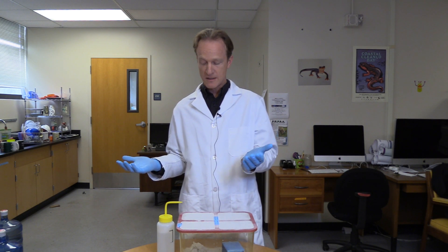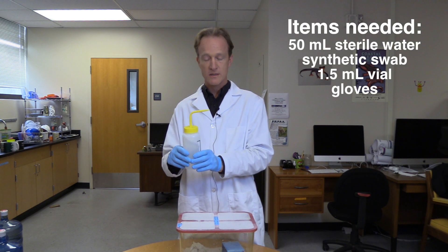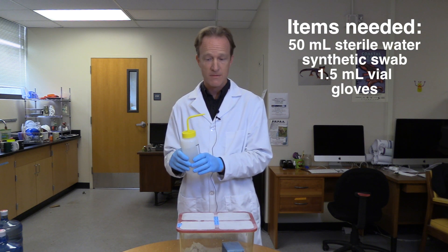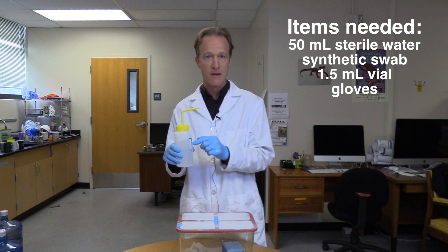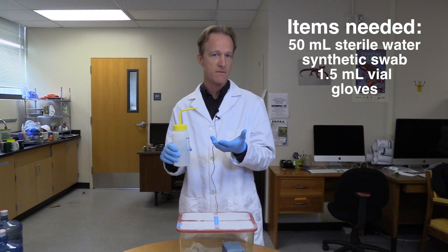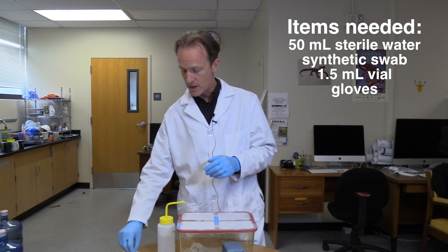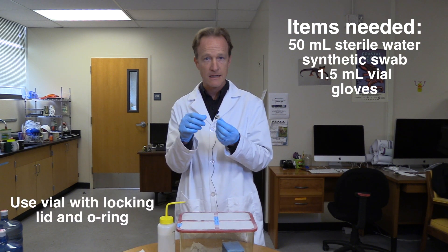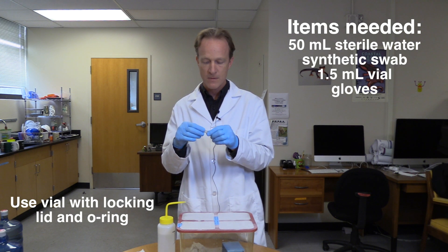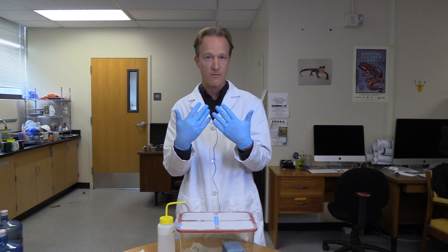These are the items that we need to collect a microbiome swab. We need sterile water, which we're going to rinse the animal with before we collect the swab. We use 50 milliliters of it to try to rinse off the transient bacteria that may have gotten stuck on the animal but may not live there. We also need a sterile swab, a vial with a locking lid — we like ones that have little O-rings in them. And we want to wear a new pair of gloves with every animal that we handle.